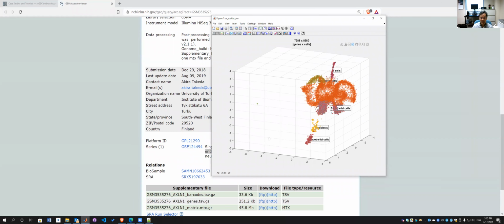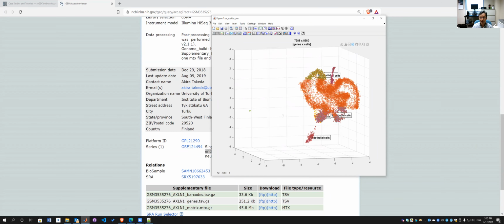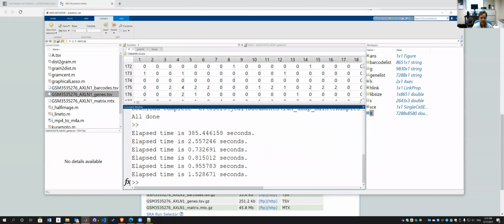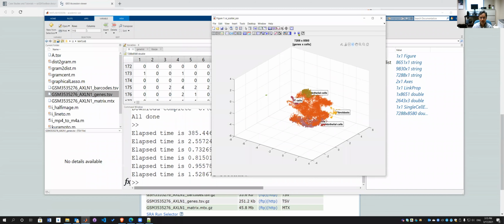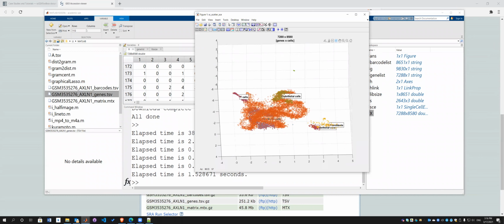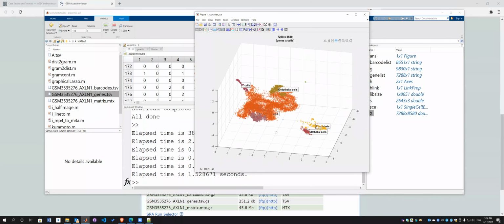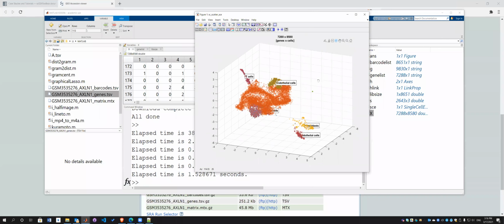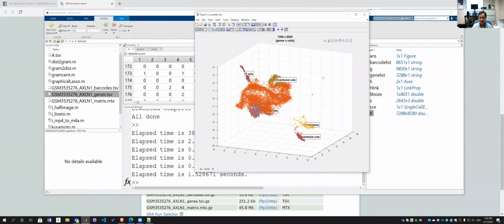All right, are you happy with this progress so far? Any questions? No questions from me. Okay. Have you got this similar UMAP or did you use t-SNE? Yeah, it looks about the same. Same, oh, okay.